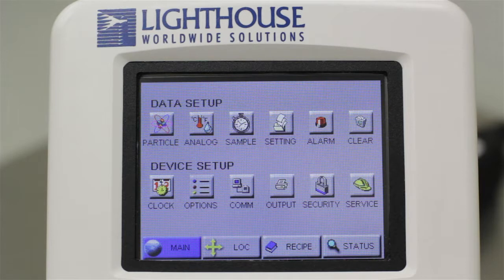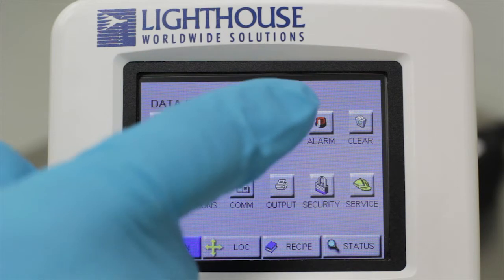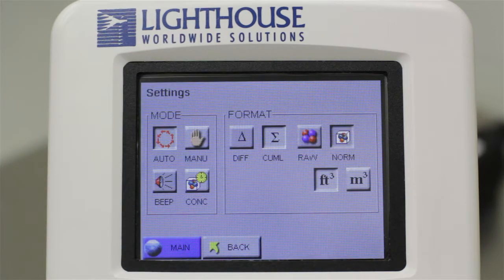Let's review your instrument's main settings, accessed by touching the settings button. This particle counter has four modes, which are explained in another more advanced tutorial — their functions can also be found in the manual. For the purposes of this tutorial, we will use Auto mode. Select this mode by touching the Auto button on the left side of the screen.